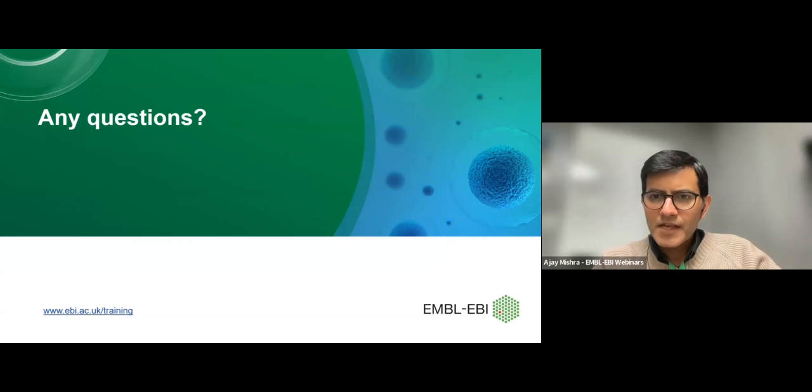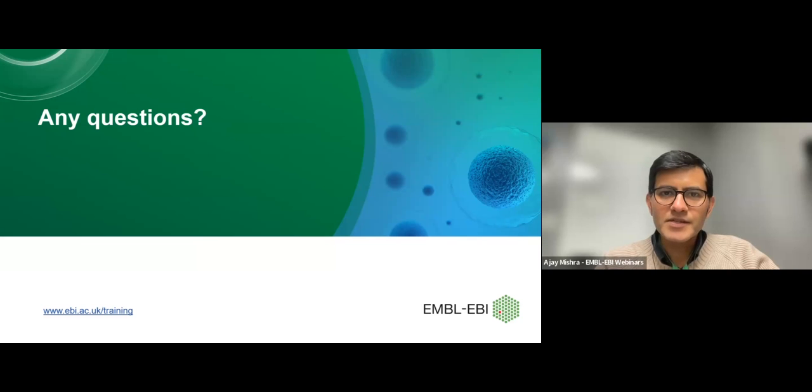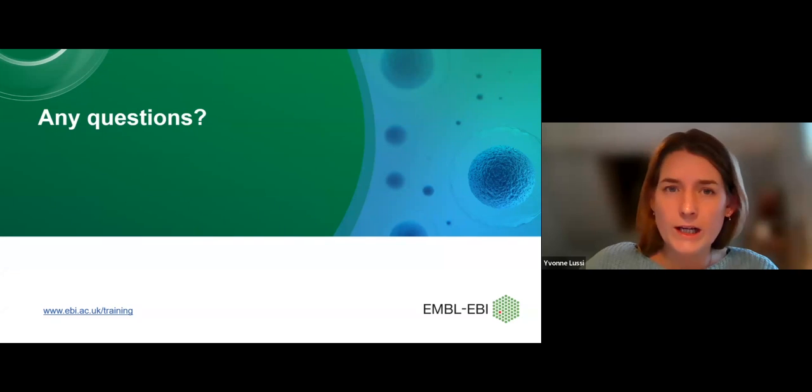Another question. Can I use the same approach in UniProt for nucleotide sequences? I have a nucleotide sequence and am struggling to analyze it. Or can you mainly do protein sequences only? Yes, you can do nucleotide sequences as well. So you can search against a nucleotide sequence, or use the translation of that nucleotide sequence to search for protein sequences. Great, thank you.